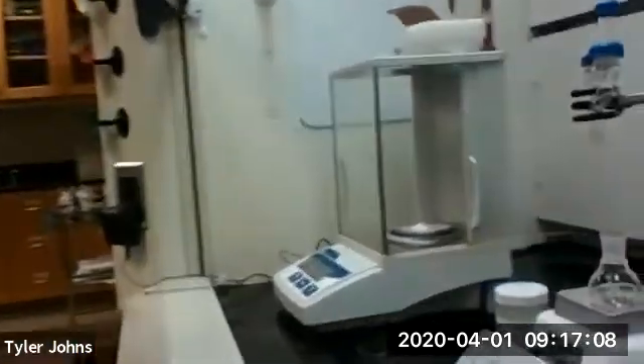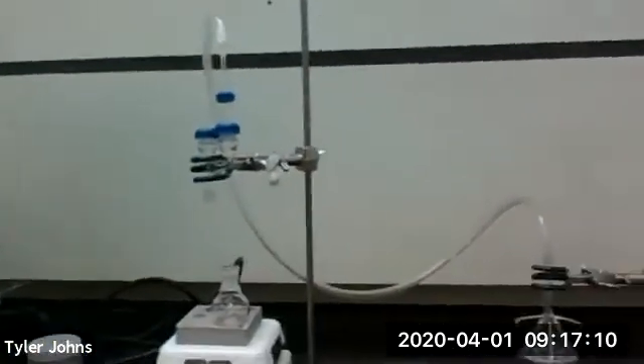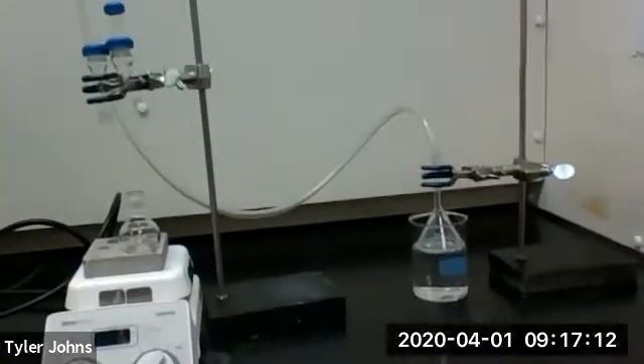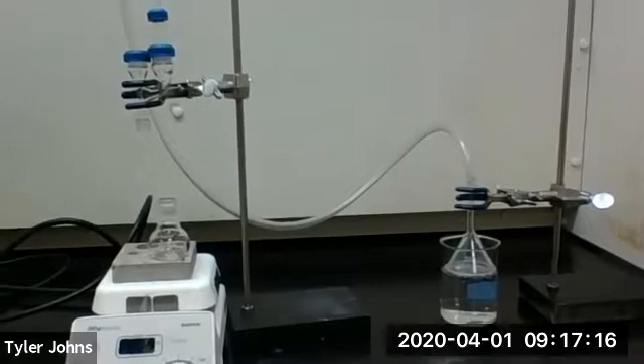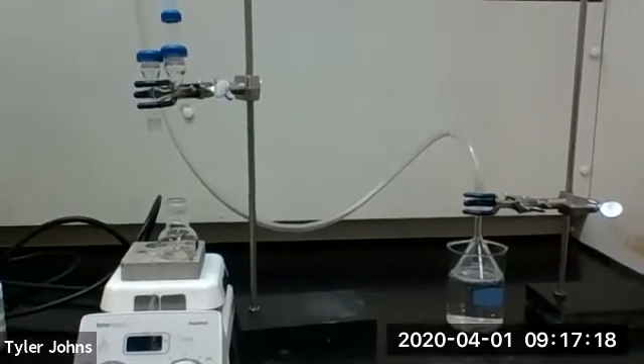To get started we first have to set up our apparatus. You can see here that we have our 20 mL round bottom flask with our Claisen adapter and our gas trap attached.